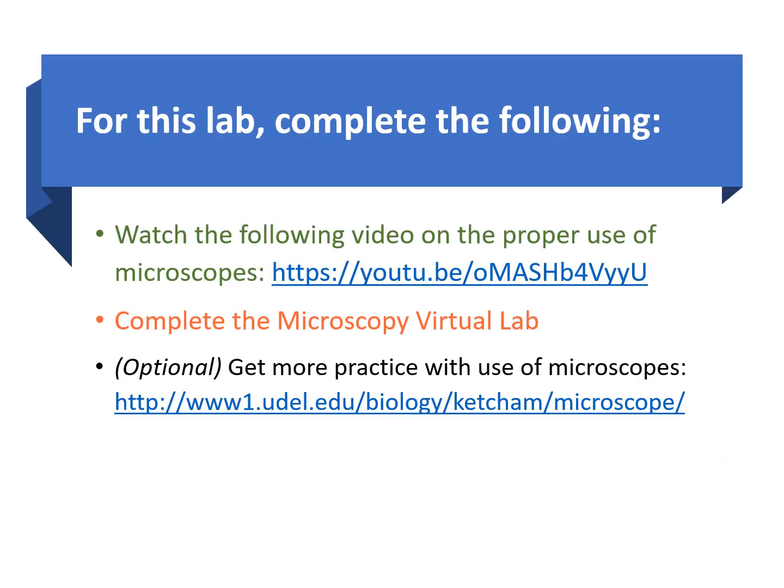And right here you have a video to watch that will go over how to properly use a microscope. There is a virtual lab for you to try out as well.